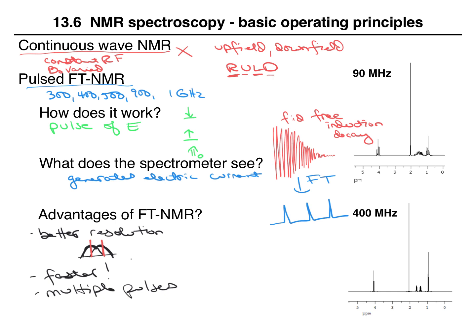If you have one pulse, then maybe it is going to lead to bumps. Maybe some of these are real, maybe some of them are just noise, right? It's just some glitch. But if you have multiple pulses and they are averaged together, then there's going to be a better distinction between what's just noise and what is a real signal. So the signal to noise ratio is much, much better when you use multiple pulses.